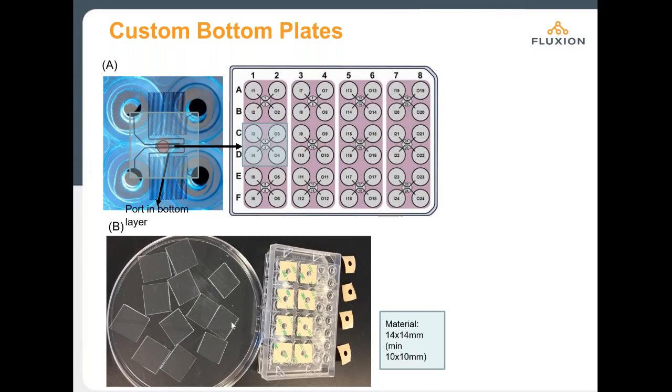But if you, for example, had a piece of porcelain that you wanted to grow a biofilm on using the BioFlux technology, you could do that now, and then later remove the porcelain and then evaluate the biofilm structure that's on it.